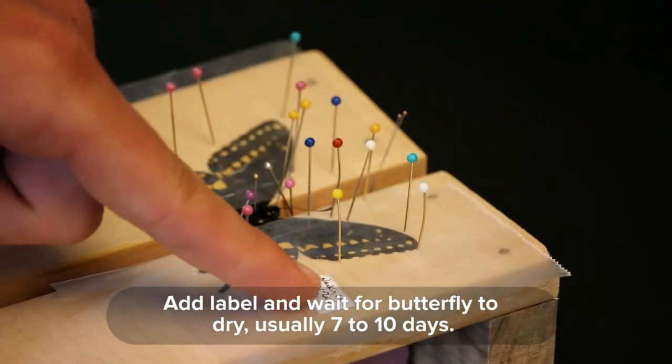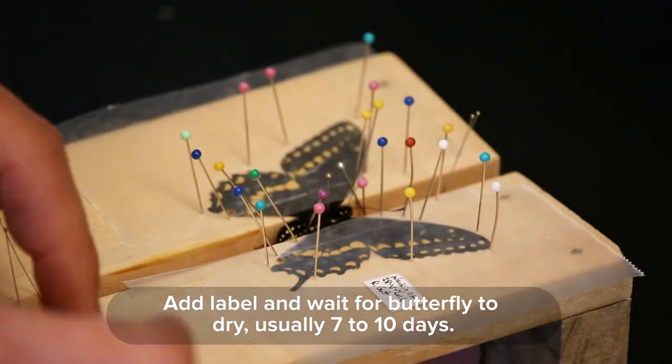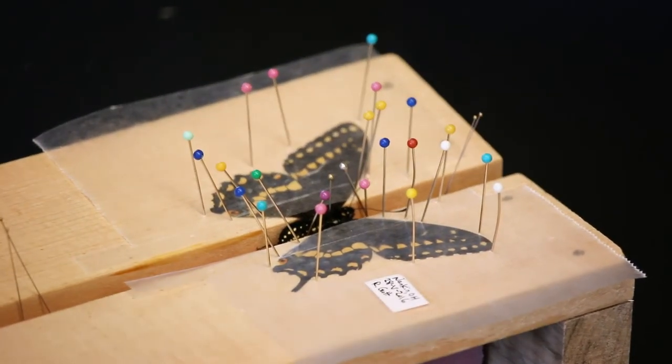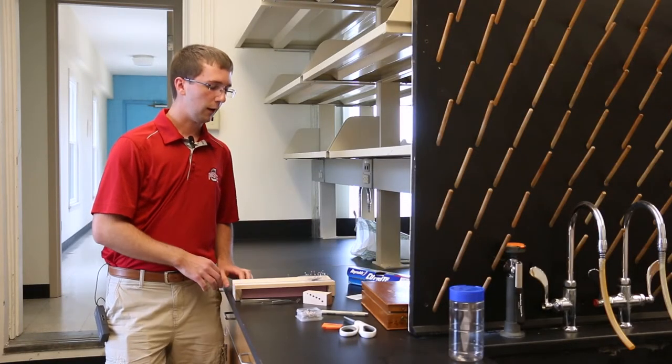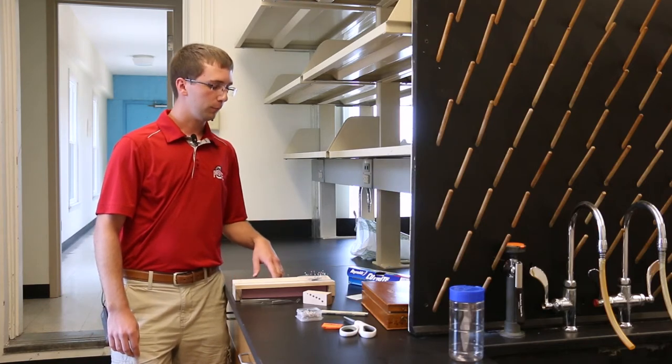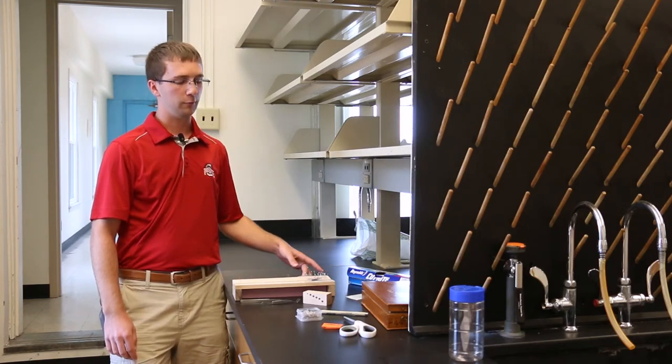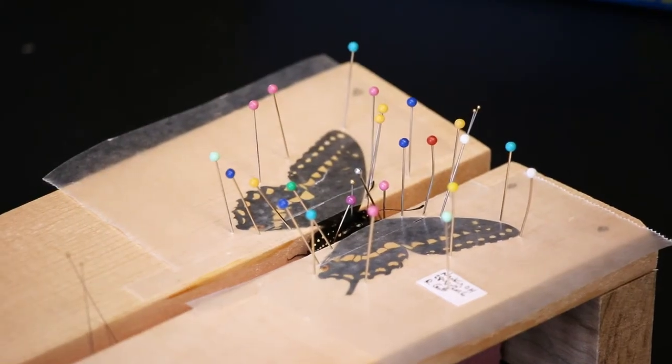Now we have a butterfly specimen that has been spread properly and will be ready in seven to ten days depending on the environmental conditions such as humidity. If the humidity is high, sometimes it'll take longer for the butterflies to dry because you have to wait for the moisture to evaporate from the butterflies to hold the wings in the proper position.